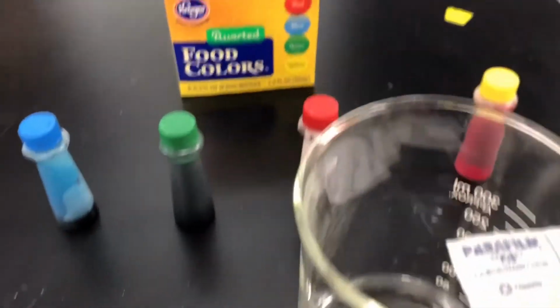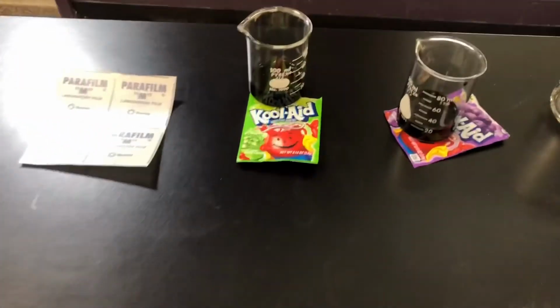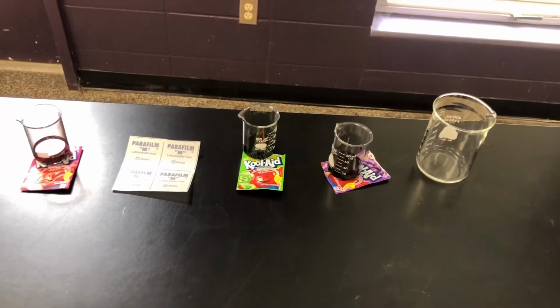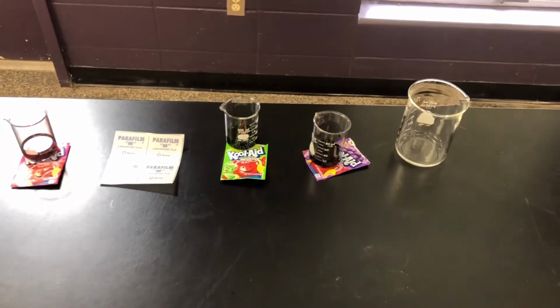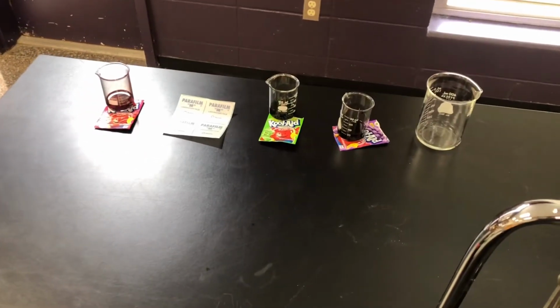Here are the 4 food colors. I will do the same thing here with food color blue, food color green, food color red, and food color yellow. And I will develop that one. And then we will do the Kool-Aid colors. We will do the lemon lime, the grape, and of course strawberry. And so afterwards, I'll get all of that done and ready. And then the next clip should be a lot of the chromatographs.